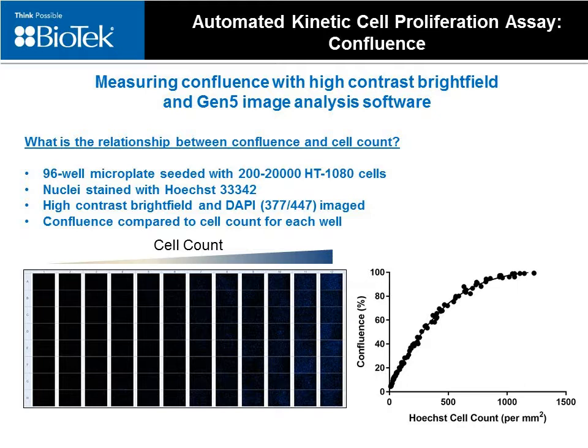However, nuclear stains are known to be potent disruptors of cell division and therefore don't support kinetic studies of cell proliferation. Alternatively, approaches requiring the generation of cell lines that stably express fluorescent nuclear tags are labor-intensive and limited by expensive reagents with often poor transduction efficiencies. So ideally, a label-free method could be used to conduct kinetic cell proliferation assays.